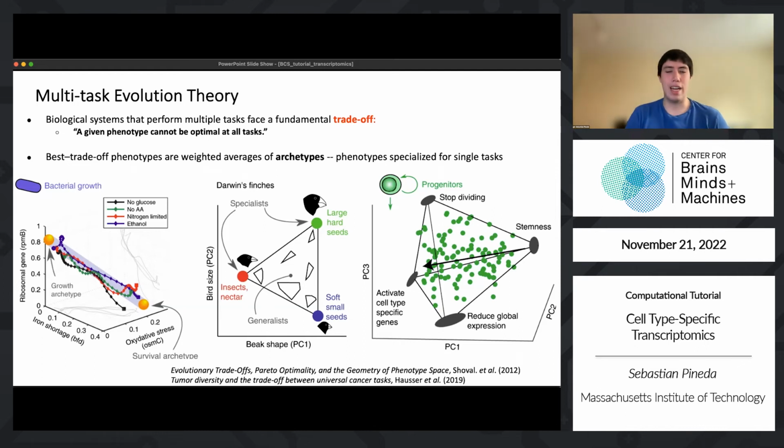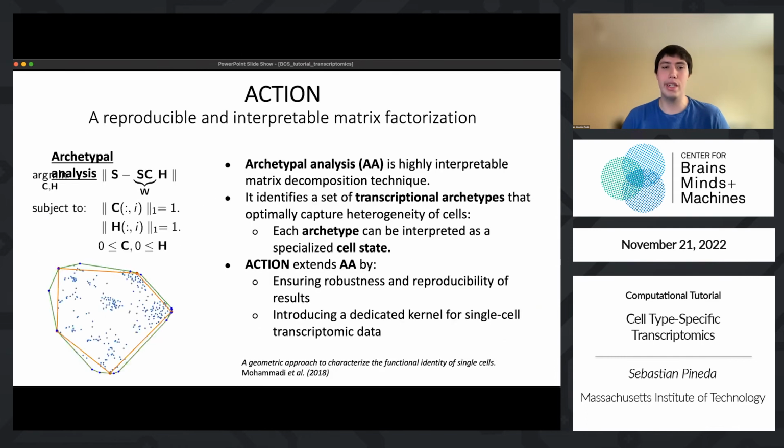If you have 10,000 dimensional data, finding the corners of this 10,000 dimensional volume is very, very difficult. So what we do is we try to estimate them, and we ask, start by showing me the 2 most extreme points, and show me the 3 most extreme, then the 30, 40, and we usually stop around there, and that's usually enough. Because once we have the corners of our data set, every other point that lies inside of those boundaries can be expressed as a combination of those points. And what this lets us do is create a reduced representation, like PCA, that is actually a lot more informative.